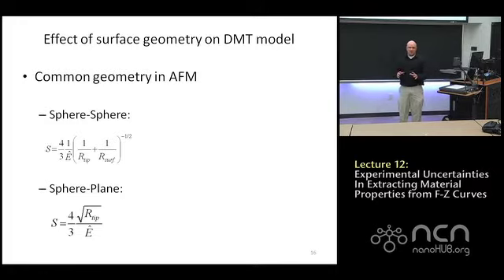So that big complicated thing reduces down rather nicely for these situations. But for your reference, if you want to do something more complicated, you have to figure out the equations on the previous slide. I give the reference at the bottom of that slide: Borsai, 1987.